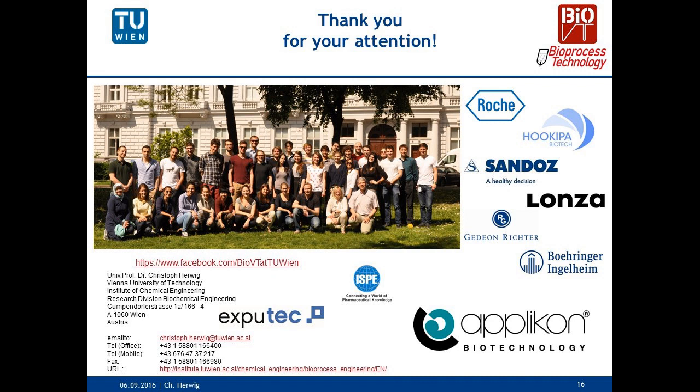We have implemented elements like that here. We have tools to tailor the sampling plan and the number of measurements you actually need to your specific process. So the tool, as I have shown you, can also be applied here. You may need some kinetic models in the background, but then you can apply the same thing to mammalian processes, yes.